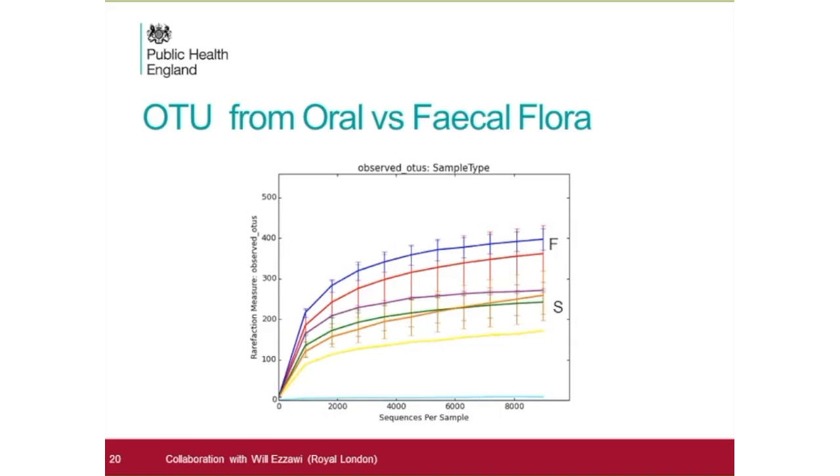With that definition, we can compare what is a core flora. Are they similar? What are the ranges of diversity and the percentage variation, using as a reference point how many copies of the 16S loci that I described earlier, and its value in semi-quantitation?